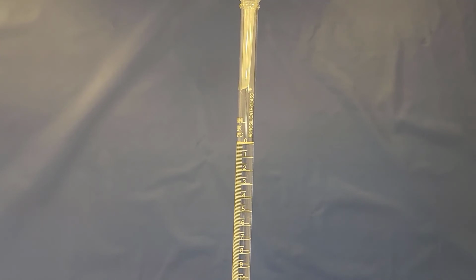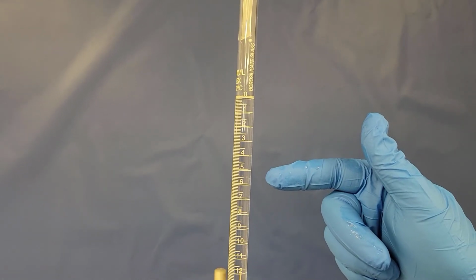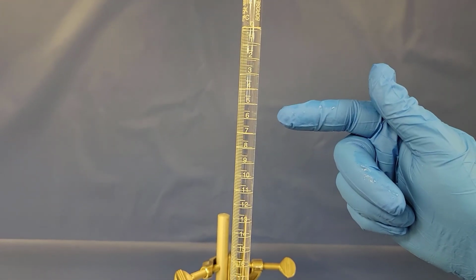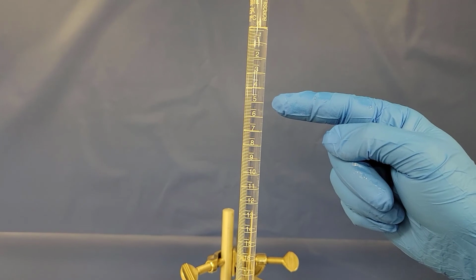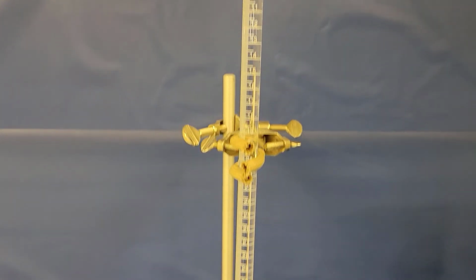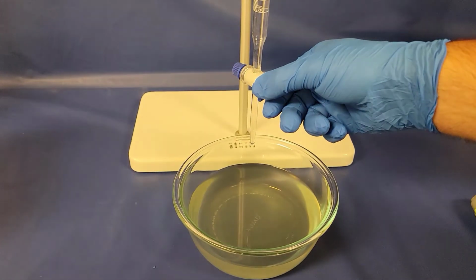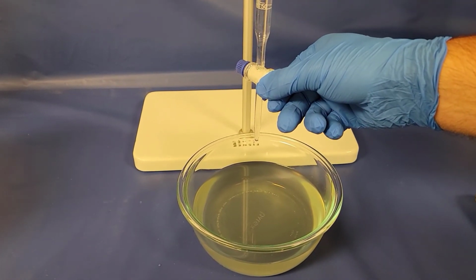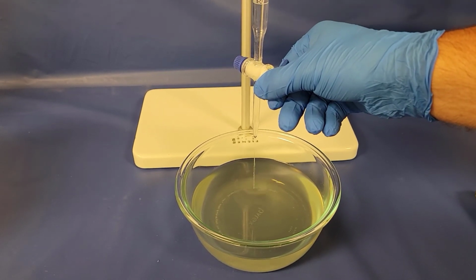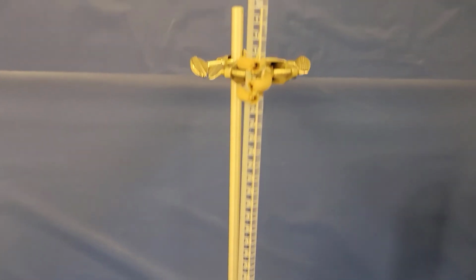Our burette here holds 50 milliliters. It starts with 0, and as you add the solution to your bowl, it'll count down how much you've added. So we're going to add 5 to begin with. The way you do that is by just opening this valve slowly, and it will slowly leak 5 milliliters of our acid solution into our 500 milliliters of irrigation water.